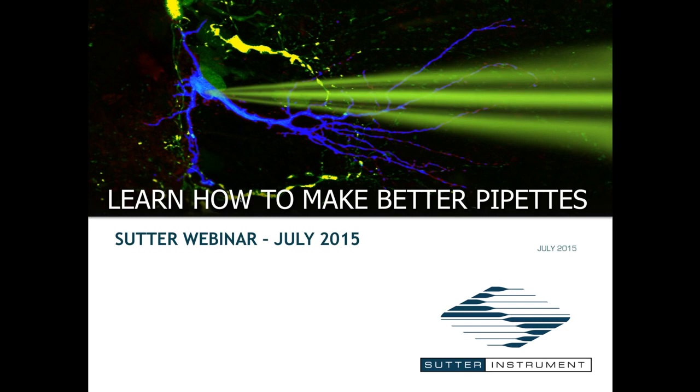I think it does. So here's another one. What causes soot on the filament, and is there anything that can be done to minimize it? Okay, so when you install a new platinum iridium filament, normally you're going to see a little bit more of this soot or this carbon deposit or this sputter coating of platinum on the shoulder or the taper of the glass.